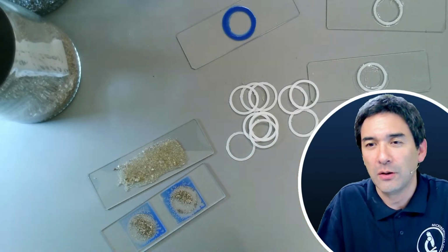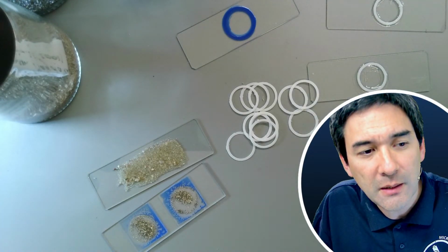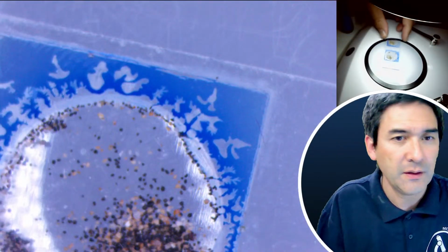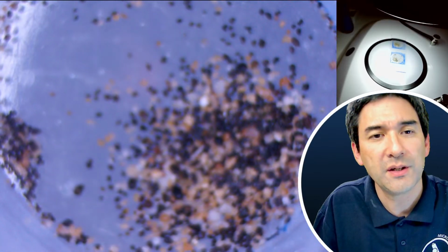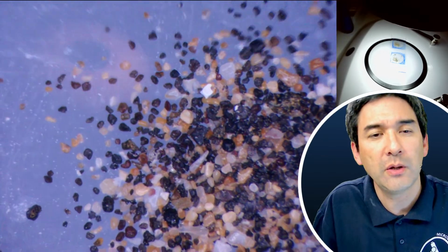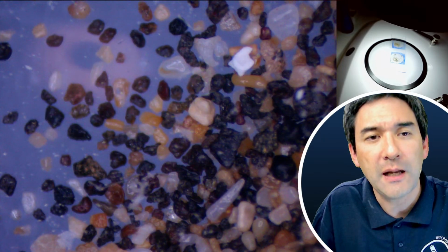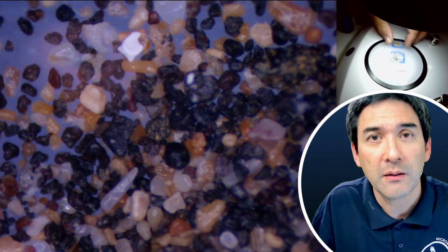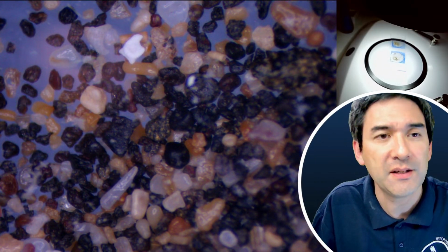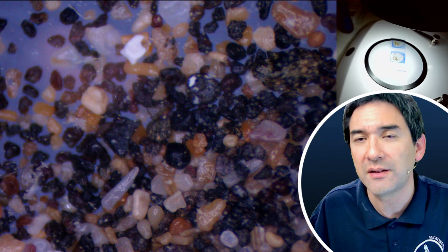So let's do the following, just so that you see a little bit how this actually looks like. The stereoscope view. Here we are with this slide, and you see the sand grains. Occasionally you are able to find something interesting as well. There are different types of sand around, of course. Quartz sand, also sand containing lots of calcium carbonate from seashells, so it depends quite a bit. But again, today's live stream is mostly focused on experimenting, making those dry mounted microscope slides.